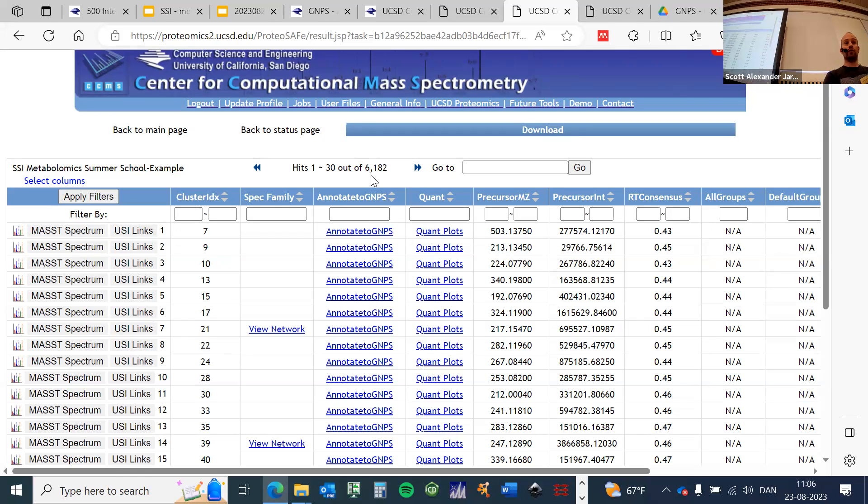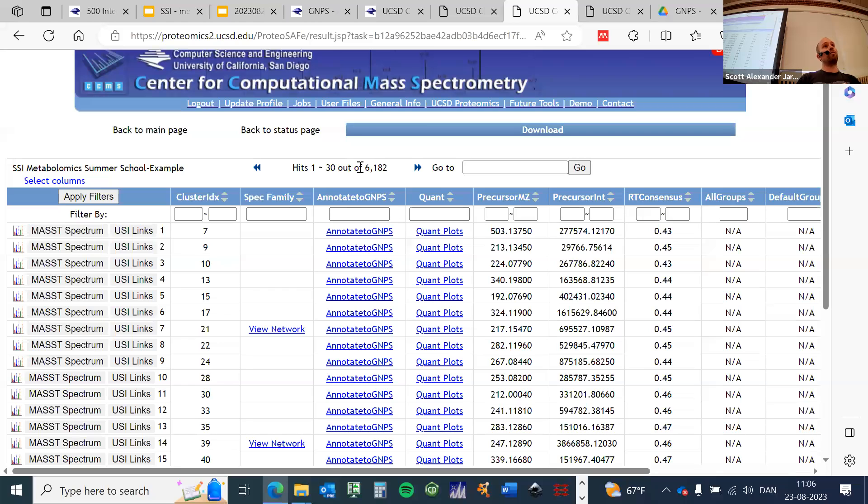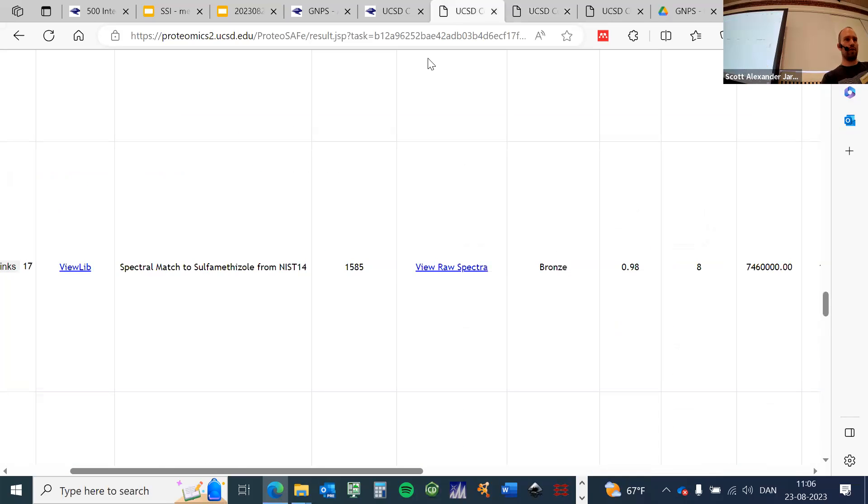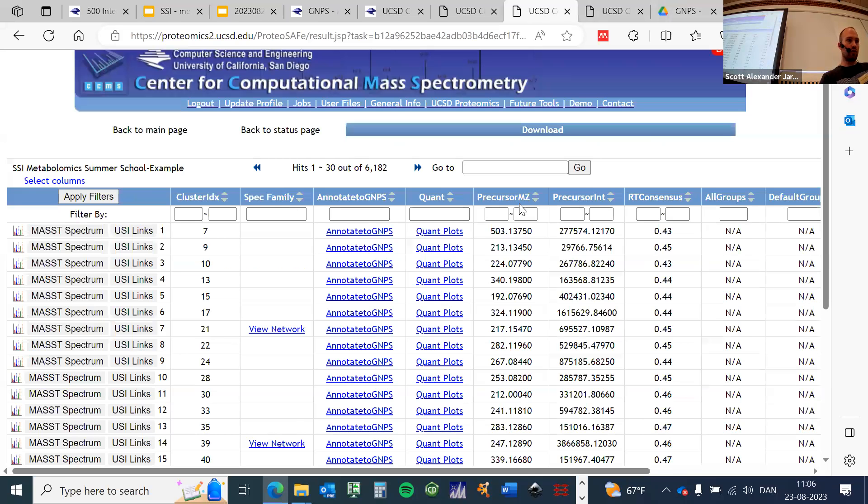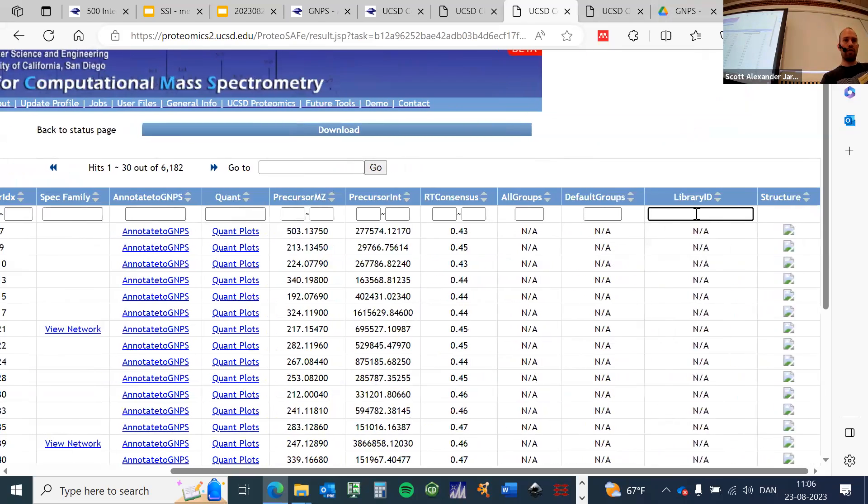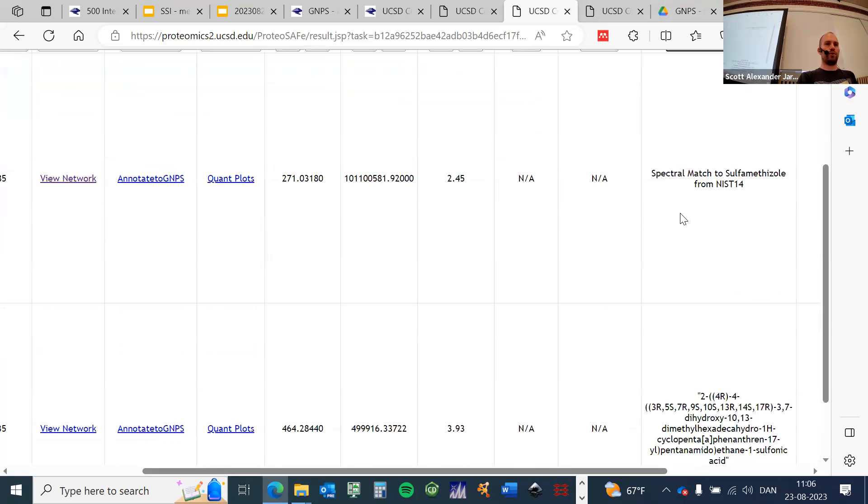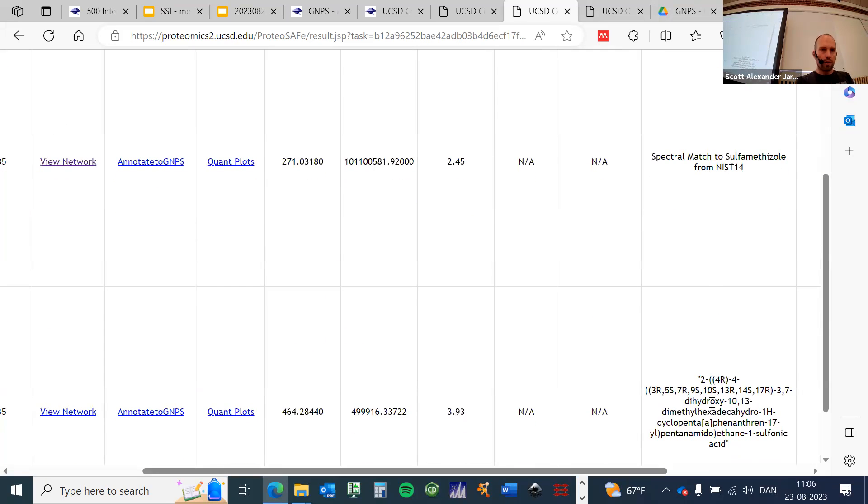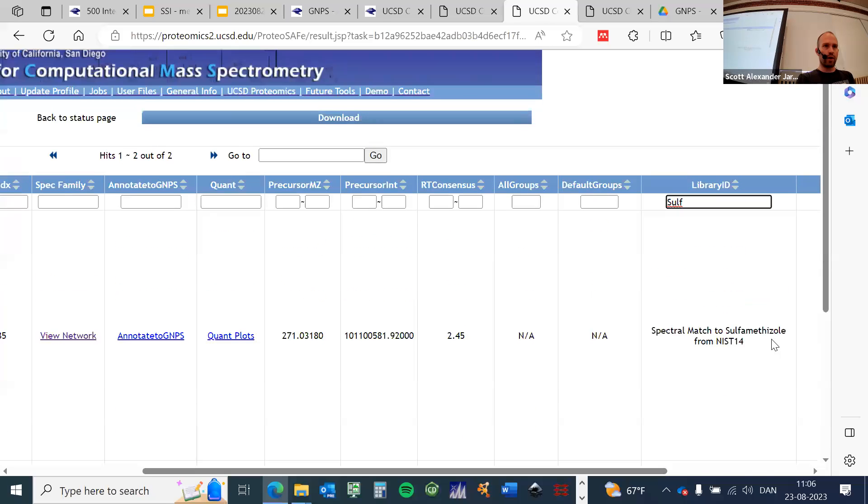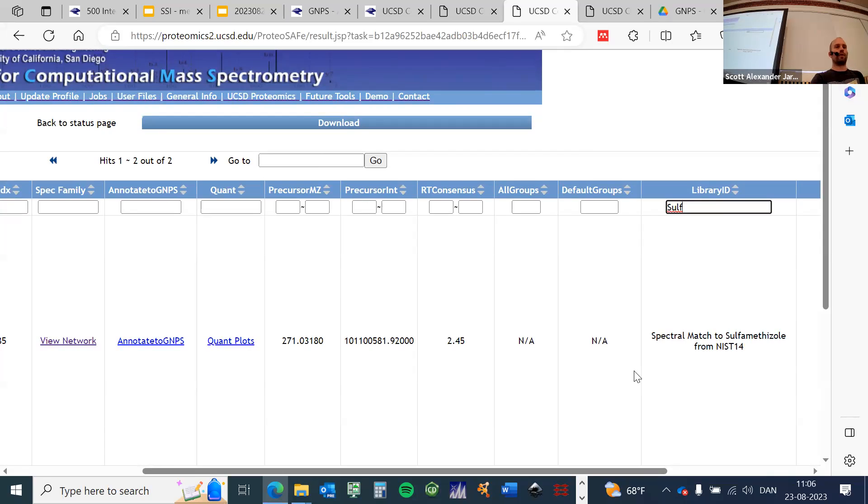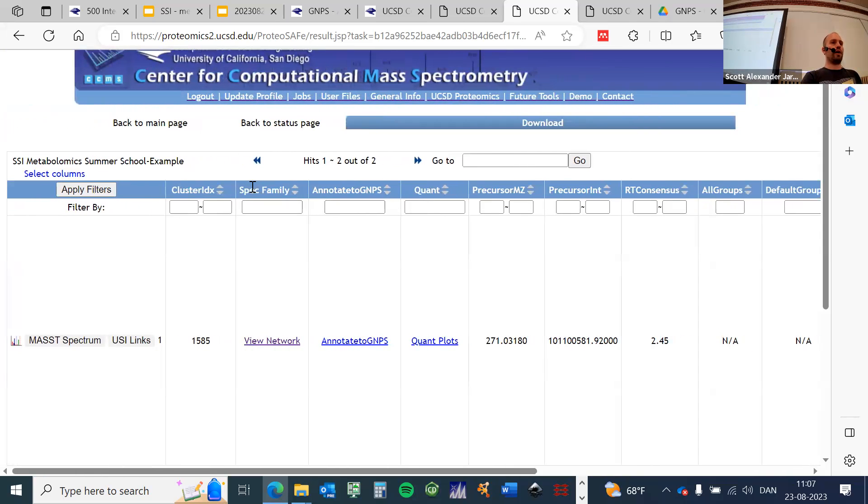As a sanity check, this number should correspond precisely to the row number of your feature table that you generated yesterday in MZmine after exporting the final feature table. Now, because I already mentioned that sulfamethoxazole, I can now search for this in here by navigating to the library ID and then just type in 'sulfa,' and then it should help me to find this. There are actually two compounds with the sulfa string in it, but this first one is what I got excited about.